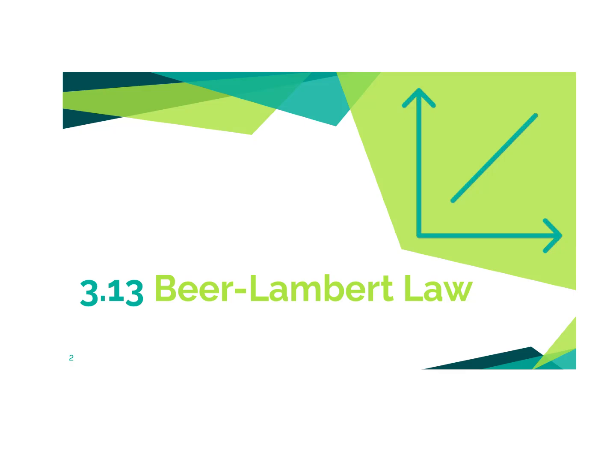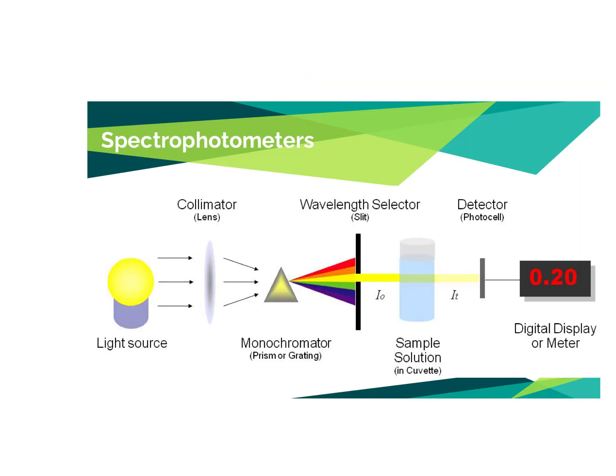Hi everyone, today we're going to be talking about topic 3.13, Beer Lambert Law. This is the last topic in Unit 3. So we've been spending a lot of time talking about spectroscopy and using light in order to analyze details about different solutions. And the way the spectroscopy works is through what's known as a spectrophotometer.